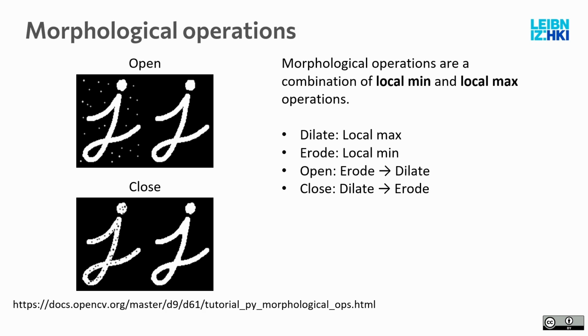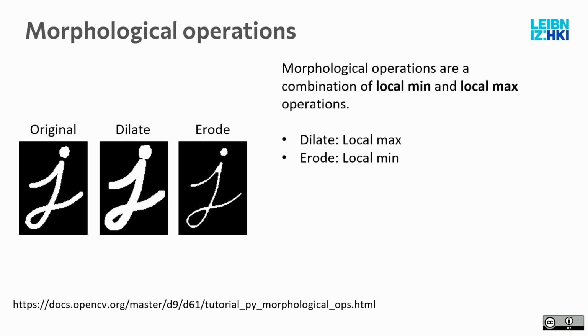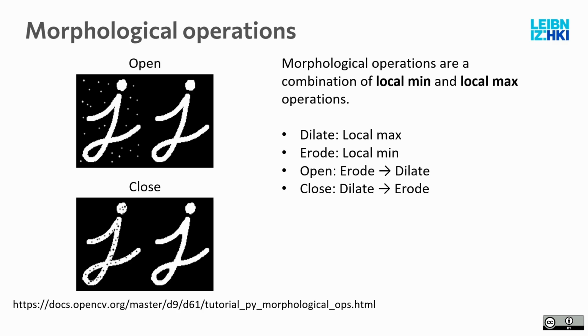You have to be careful with the radius, because you can configure them. You can set the local area around it, and also a structure element. If it's a disk element, it would round off the objects a bit, usually more useful for biological data. But if things are connected like here in this dilation image, this is not going to disconnect anymore after that. So you can accidentally connect things with the closing operation that should not be together if you set it up wrong. So be careful with that. And then splitting them up again is really fun. Not.